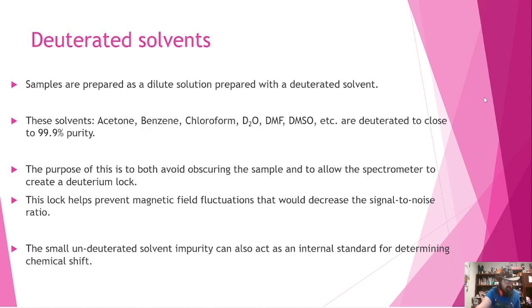Now, one other thing to consider is why we use deuterated solvents. The idea is that we are measuring all hydrogens and all C13s.